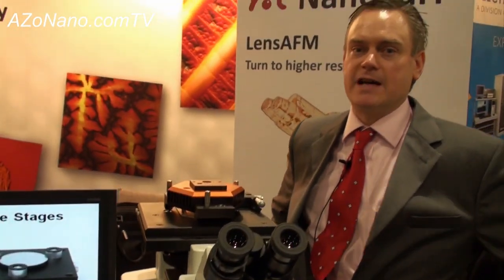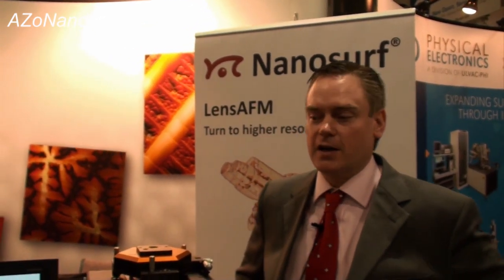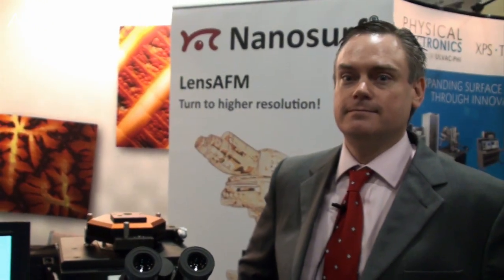The Flex is a system that we've designed for researchers. It's affordable, modular, and easy to use, like all of the NanoSurf systems in the past. We aim to make it primarily a very competitive system with an assortment of options that will be of use to the research community in biology, materials, polymers, physics, whatever the application may be. Thanks for telling us about the Flex AFM and all the various options. If anyone wants more information, they can go to the website, which is NanoSurf.com.